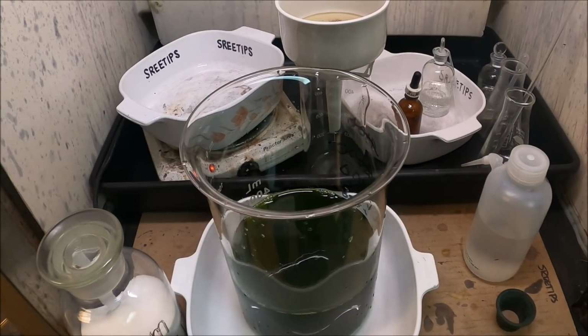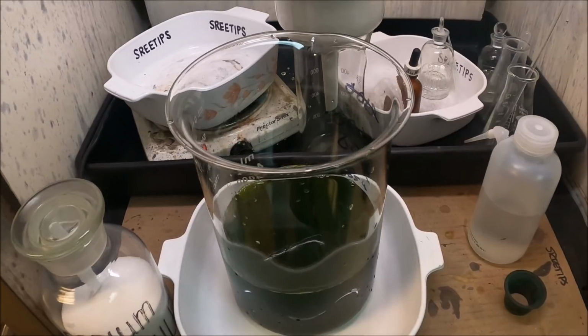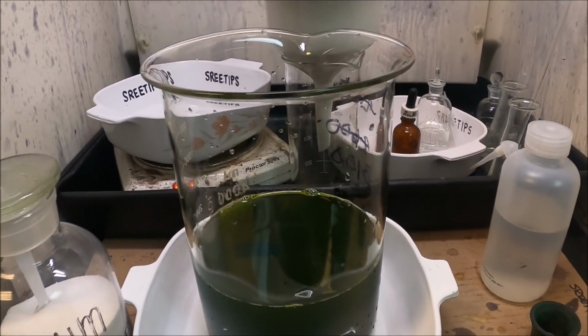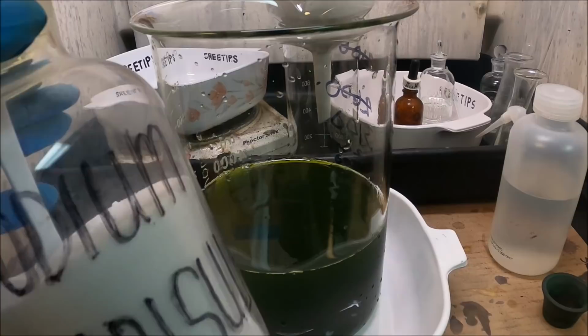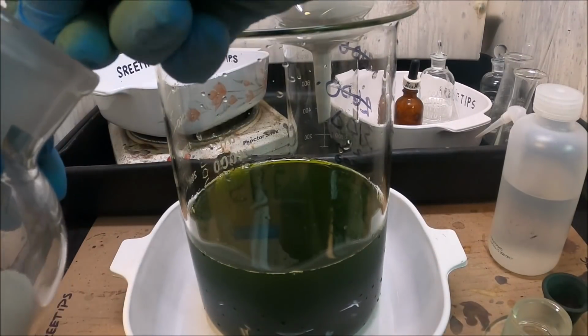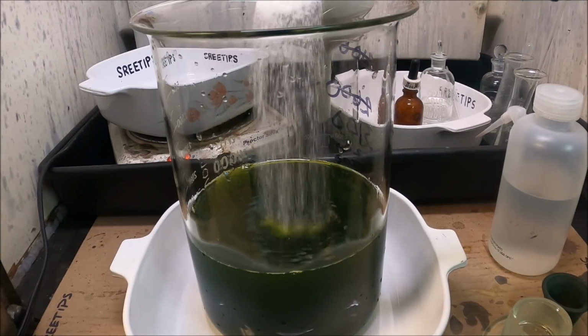So now what we'll do is, I'm gonna adjust the camera angle here, show you the precipitation. We're using sodium metabisulfite to do the precipitation. Here we go. First spoon going in.